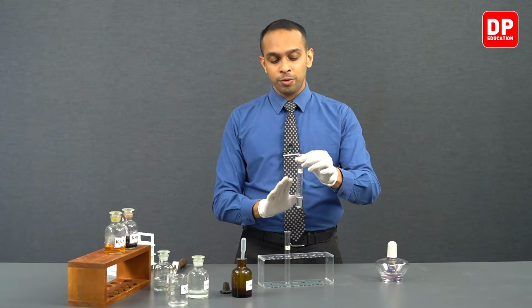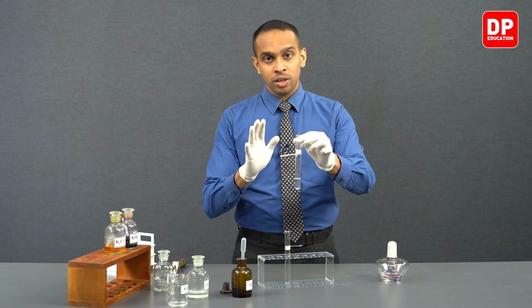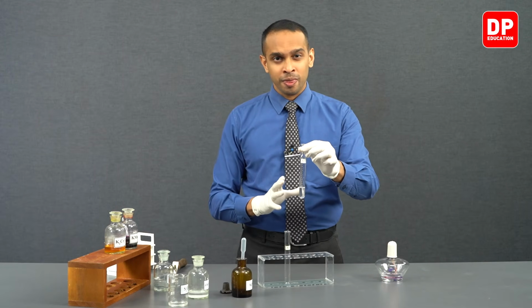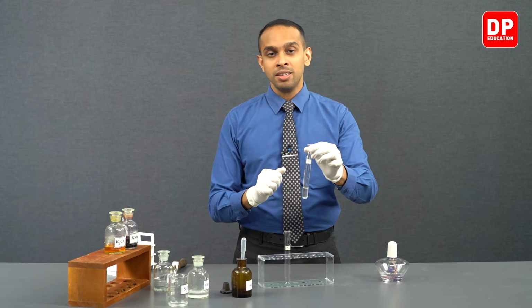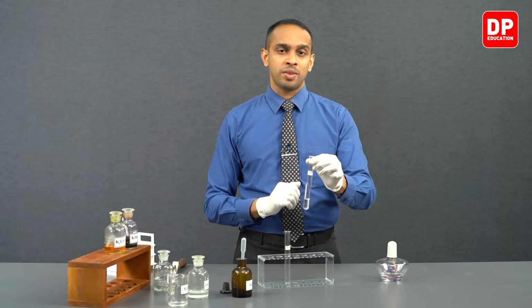Now students, before I add silver nitrate into this test tube, let me tell you the reaction that is actually taking place here. Silver ions will come into contact with the thiosulfate ion and will form silver thiosulfate. Silver thiosulfate is unstable, so it decomposes readily to form silver sulfide.